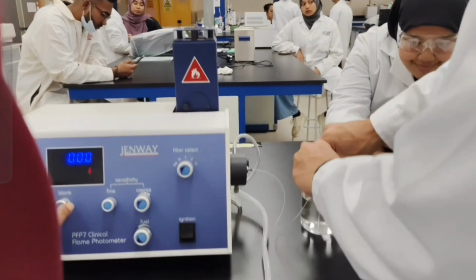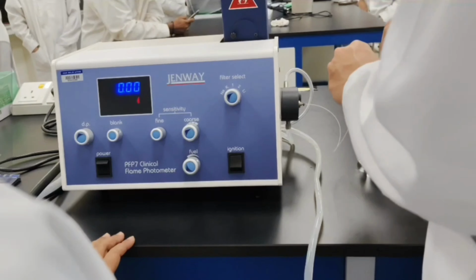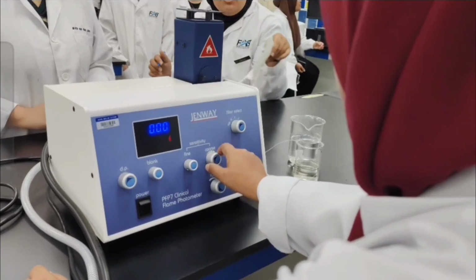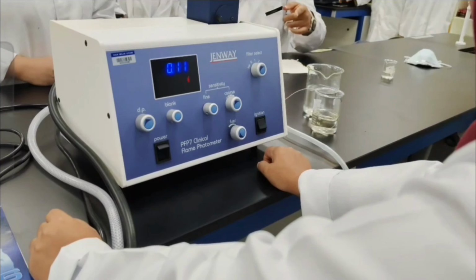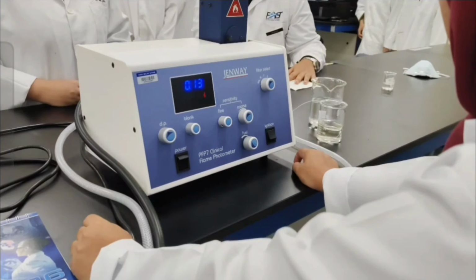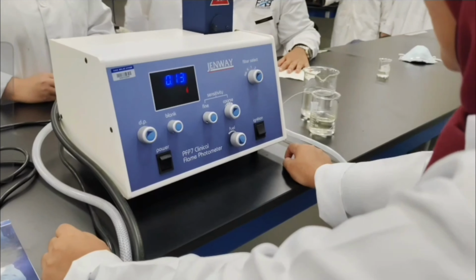First, we rinse the instrument inside using distilled water, so that there is no contaminant inside the instrument when we analyze the sample. Then we tune the instrument so that it will be more suitable to analyze the concentration of Na in the sample. It can also be tuned for the concentration of K as well, kalium.